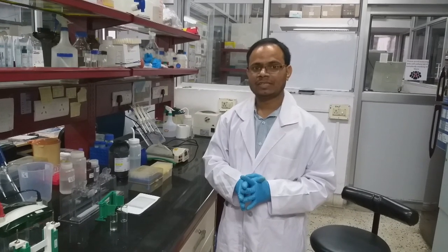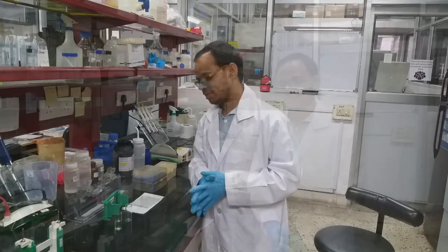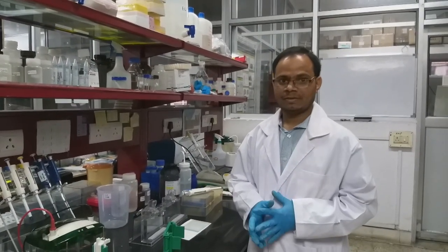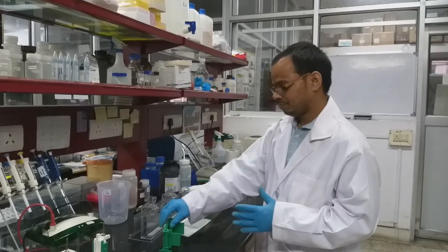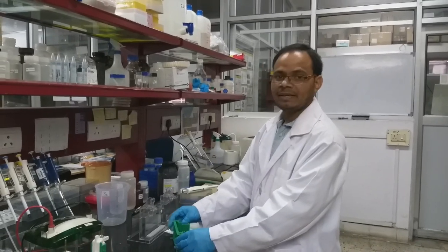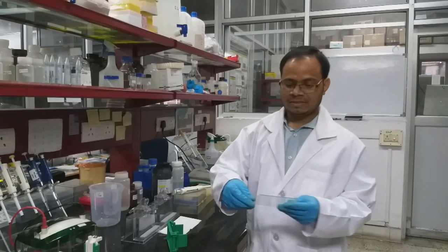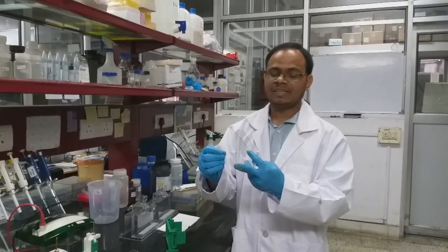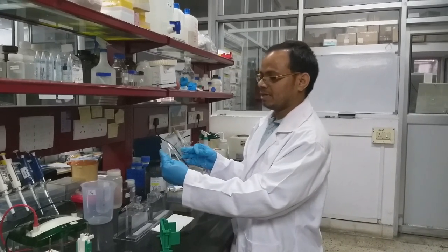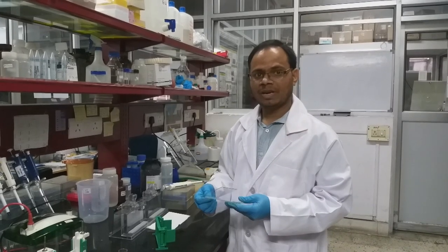So let's start preparing the gel. We will learn more things while preparing the gel. Before preparing the resolving gel, we have to set up the casting. So these are the glass plates. This is a very thin one. This is the main glass plate. This is a 1.5 mm glass plate. It is available in 1 mm glass plates also.